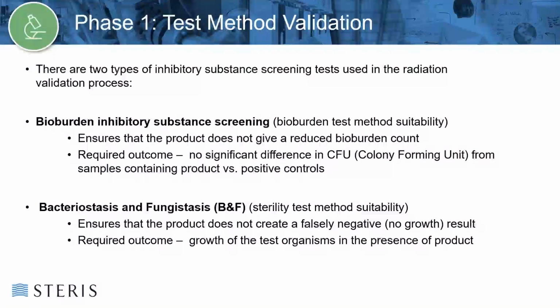This is a qualitative test, so presence or absence of growth, and is tested against several compendial organism strains. The required outcome for this test is that there's growth of the test organism in the presence of the product within the incubation period.